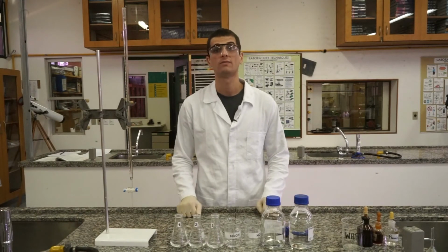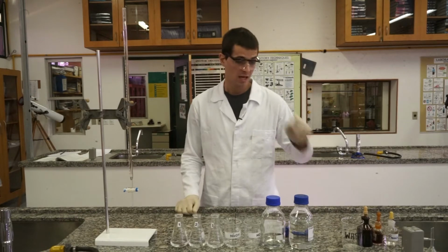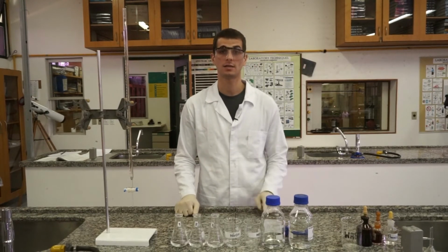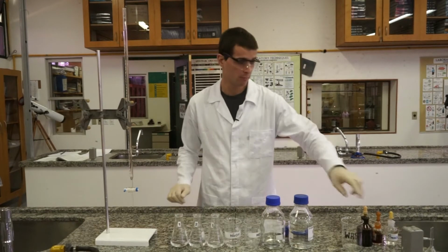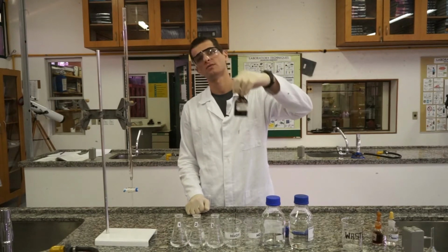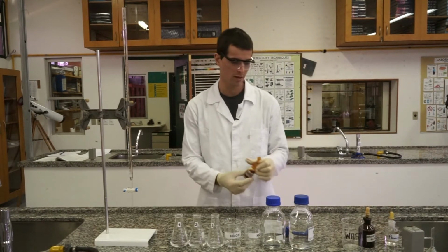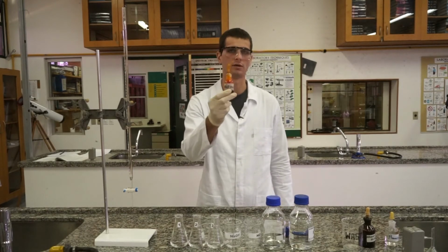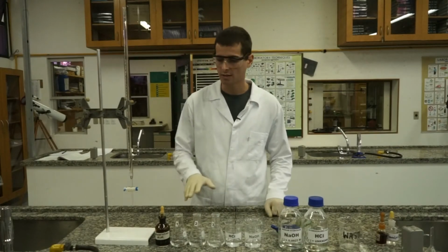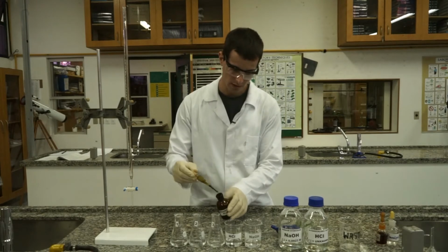Now that we have performed the titration using phenolphthalein as an indicator, I will repeat exactly the same technique, but this time using Bromothymol Blue as an indicator to mark the endpoint of the titration. And lastly will be the Methyl Orange. Before I start, I have to add a few drops of Bromothymol Blue in each Erlenmeyer flask.